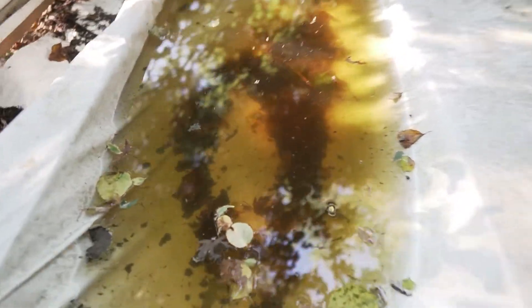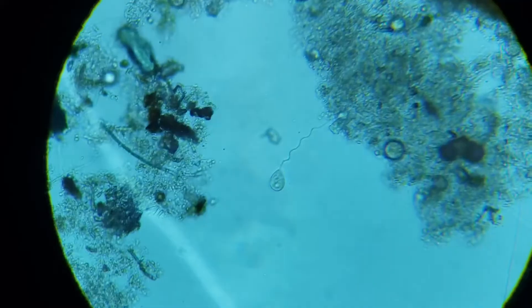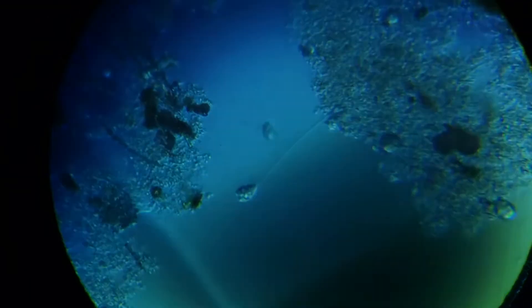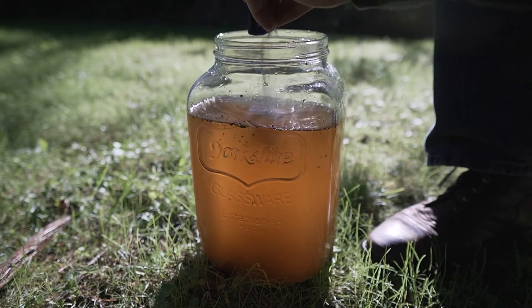I'm going to take two and a half gallons of this nasty standing water. There's a ton of decomposing leaves and creatures and organic matter in here. I'll even toss in a little bit of dirt for good measure. We're going to mix it all up, take a look at it under the microscope so we can see all the bacteria, and then I'm going to treat it with one of these P&G water purification packets.